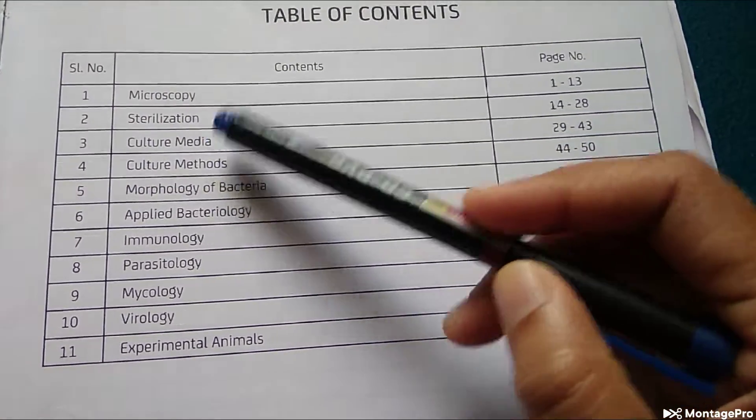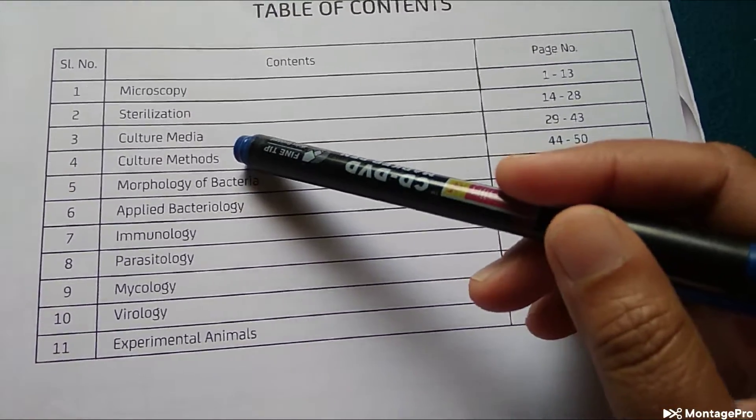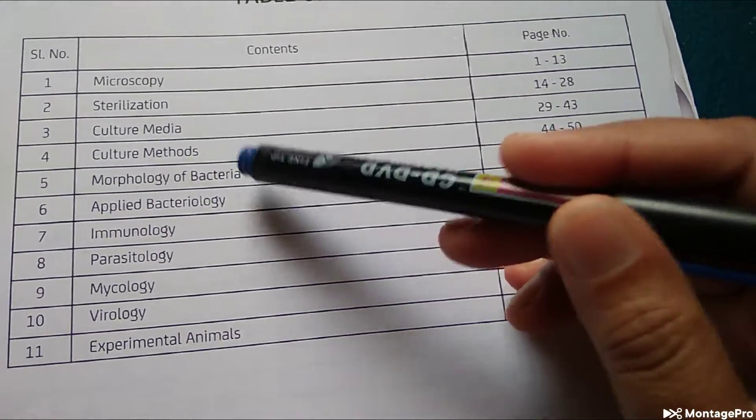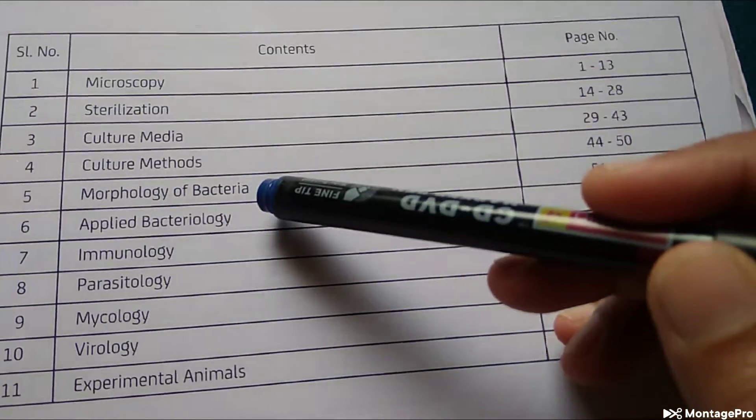Then culture media - so many types of culture media, all the colors you will know. Culture methods like aerobic and anaerobic, morphology of bacteria. You will learn to know whether it's a cocci or a bacilli. Applied bacteriology.